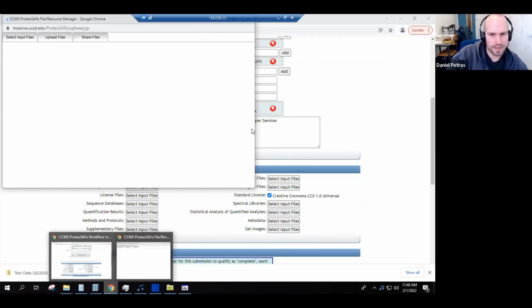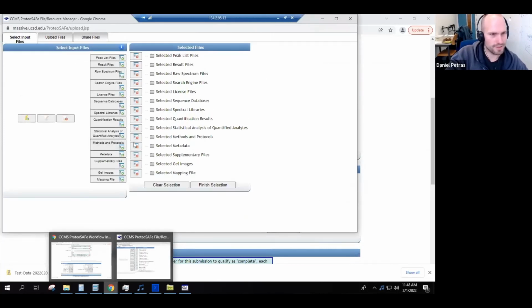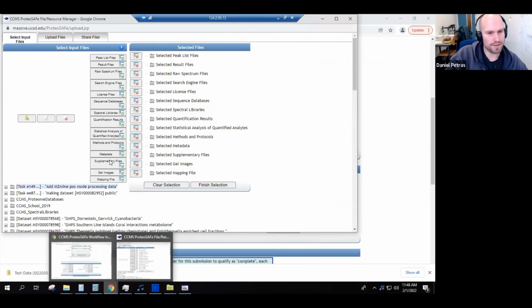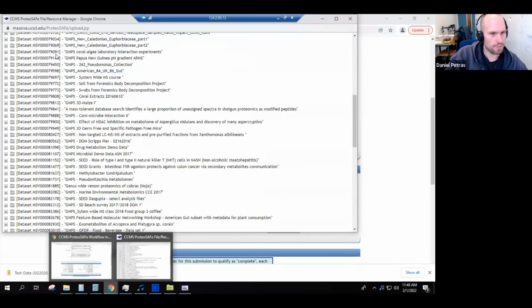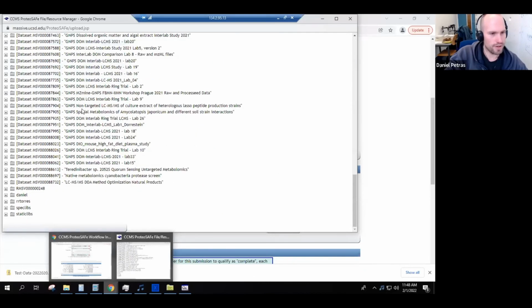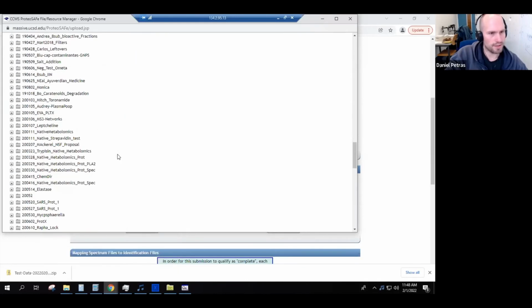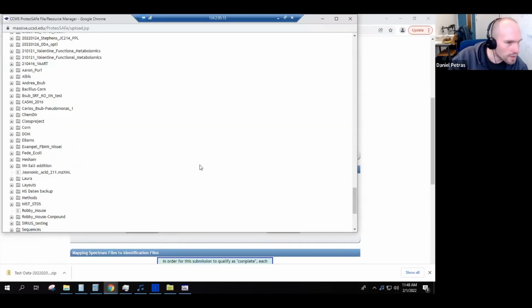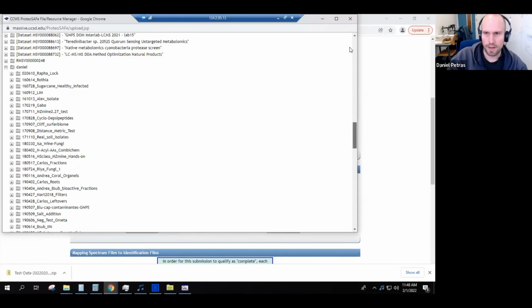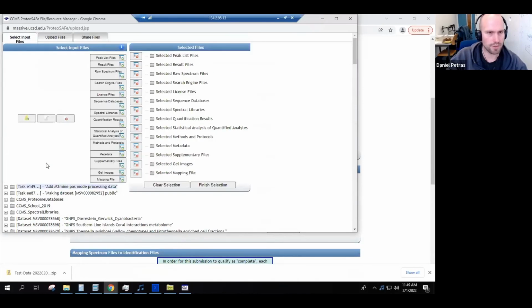Okay, seems like the internet is a little slow here today, but slowly it's loading. What you can see here on the left, first of all on the top, are different public data sets I already used, but also under my username there are different private data sets I uploaded over the years. You can see there are quite some folders, but for you this should probably be all empty if you just created your account.